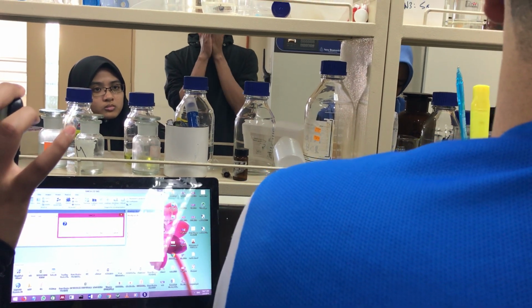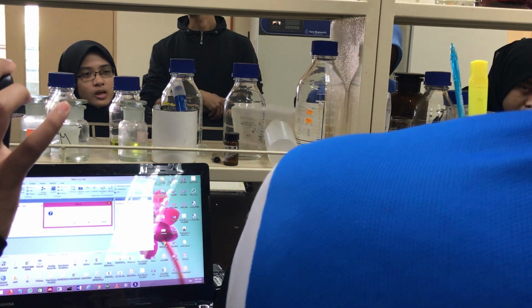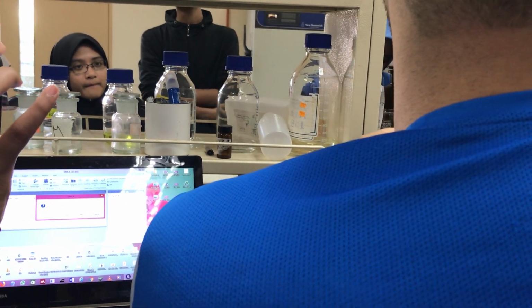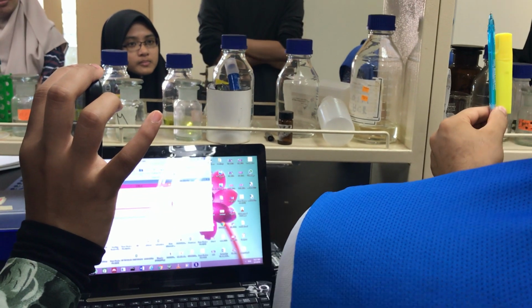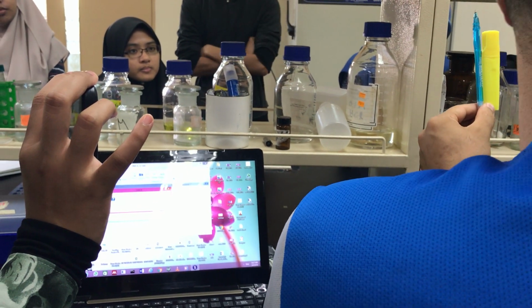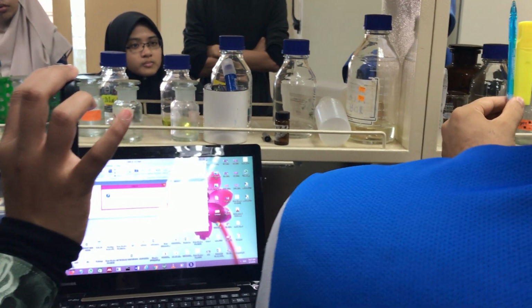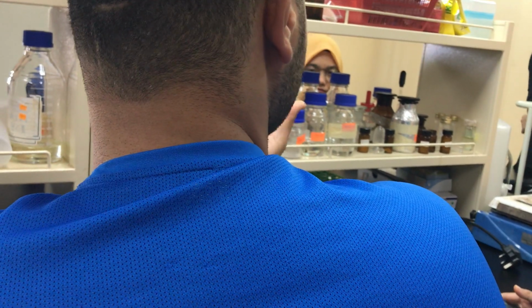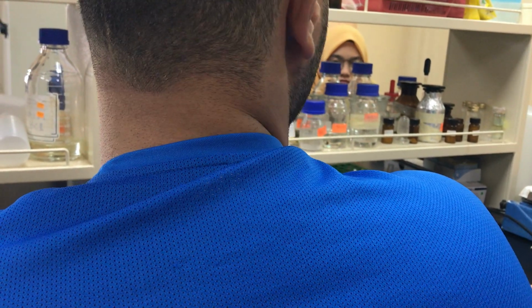The total should be 100%. If the first component predicts 50% of the difference, the second component like 20%, the third component 10%, and so on, how many components can we get? Sometimes 13, sometimes only 3 components. Only three components can count all the difference among the extracts or the spectra. That's why we have to see the difference.